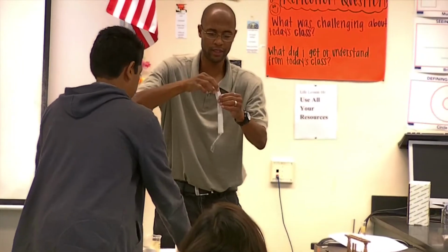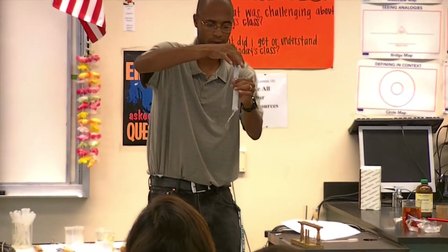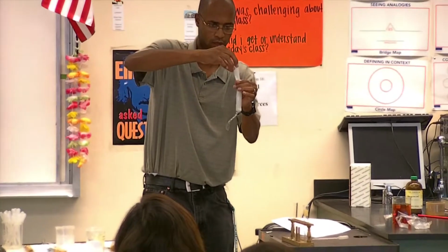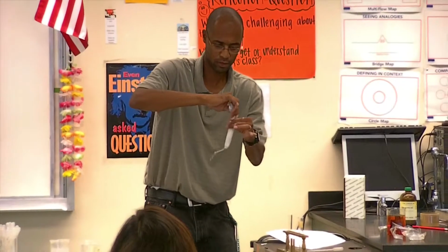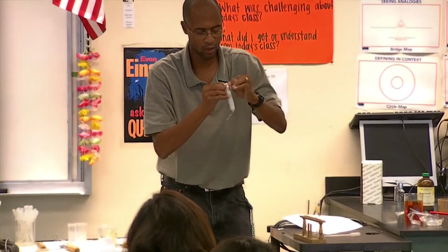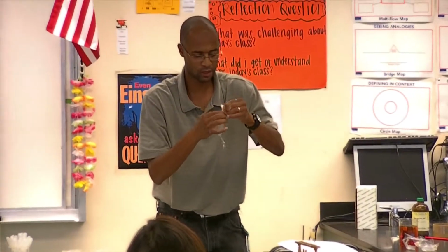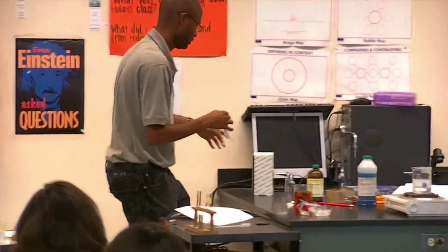Now, in both of these we have starch and sugar inside. So what I'm going to do is tie this up right about here, a little higher up. It's like doing a water balloon. With this, I want to make sure it's nice and tight. But now, watch what I'm going to do next.